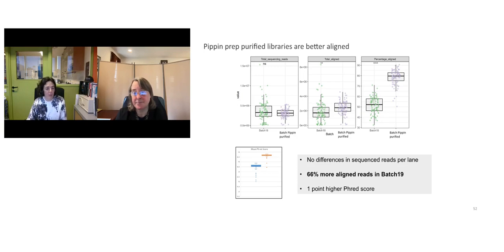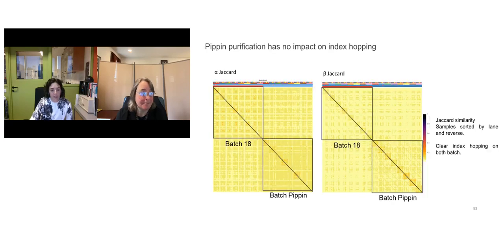So increasing the TCR sequences that were actually really sequenced in your sample. That was quite positive because we found a way to have cleaner data sets by removing those long and short reads. But our point was to try to remove the index hopping, and this is where we were not that satisfied.